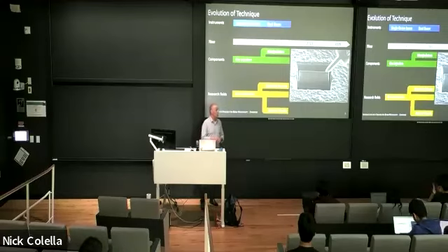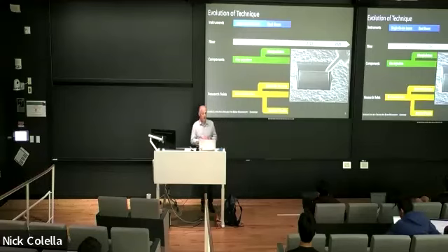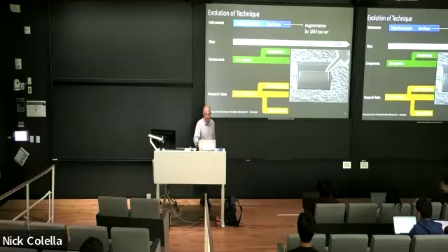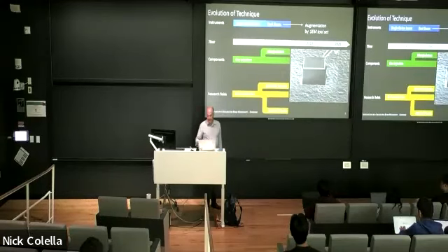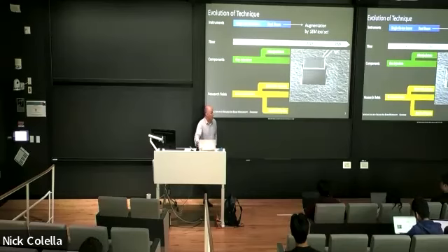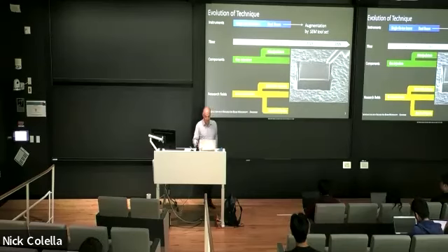So the next logical consequence is to combine a focused ion beam with an SEM column, and this is basically the dual beam focused ion beam. Furthermore, we have now the development of manipulators that allow to extract material. And so this was then basically the onset of preparation of TEM samples.